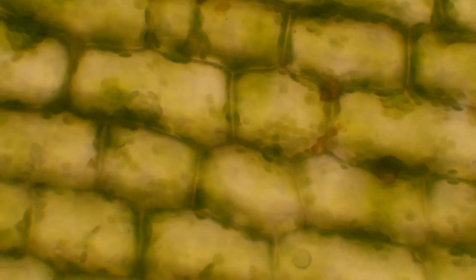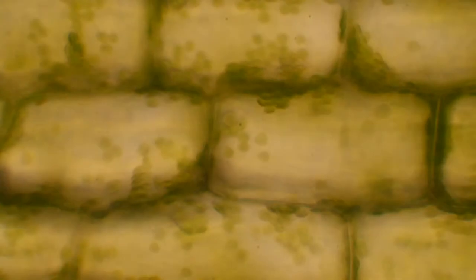Check this out — these are the cells in a single leaf of a freshwater plant. They look a little bit like bricks because they have a tough cell wall which gives them their shape and structure. Your body is made of cells too, but your cells don't have these tough cell walls like plant cells do. Plants also have these green blobs called chloroplasts, where that amazing photosynthesis process happens — where plants make food with solar energy.